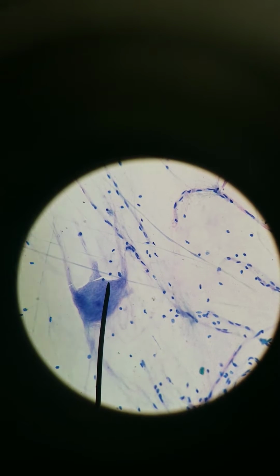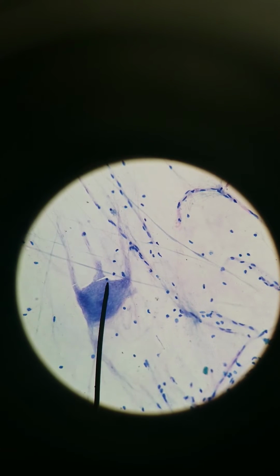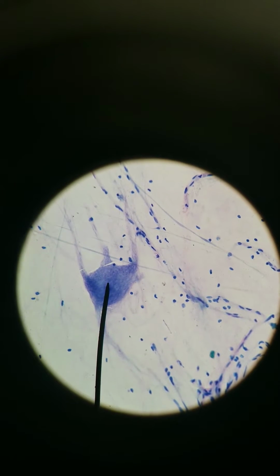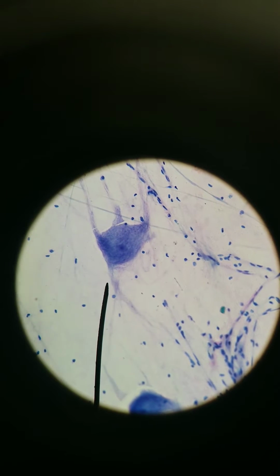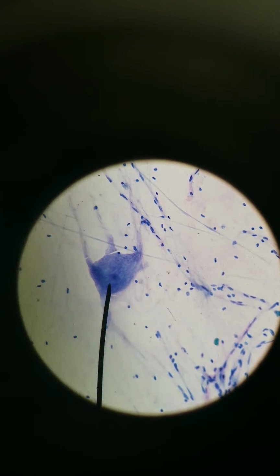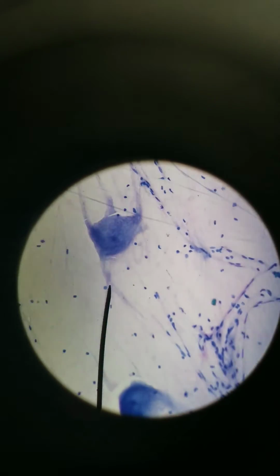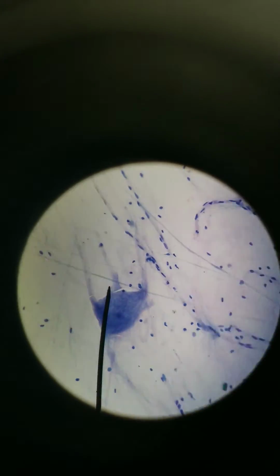If the extension is darker, continuous with the cell body, it's a dendrite. So this is likely a dendrite, this one is likely a dendrite, this one is likely a dendrite. This is likely an axon, what's extending out this way. Axons don't have the same staining that the cell bodies do. They're called Nissl bodies. It's really just all the organelles like endoplasmic reticulum that are stained in there. Dendrites have that, axons don't have that. So once again, axon, it's lighter colored. Dendrites, they're darker.